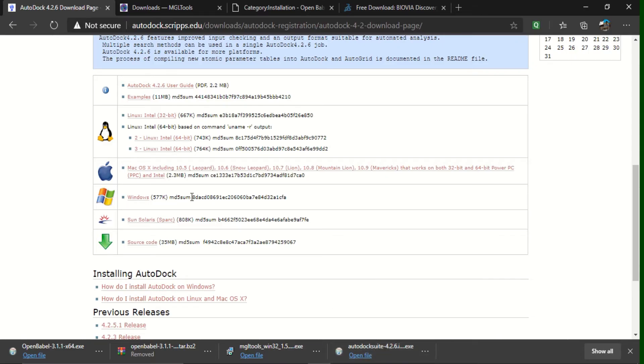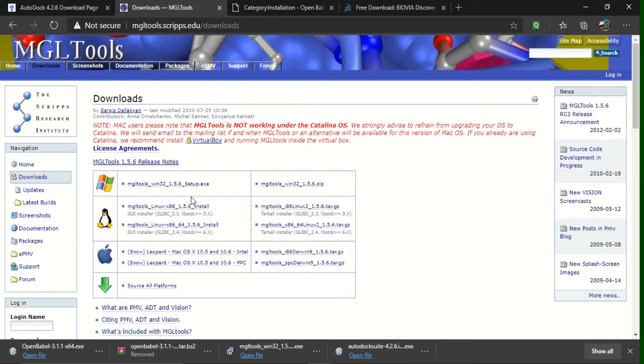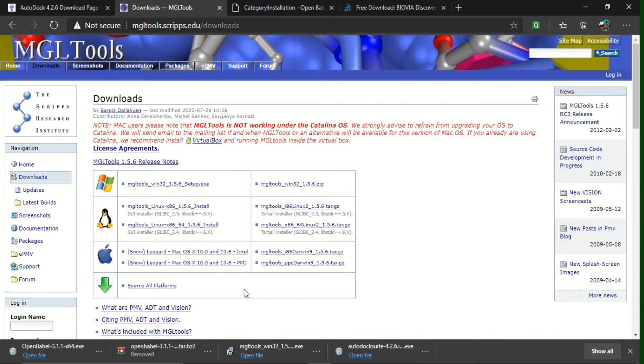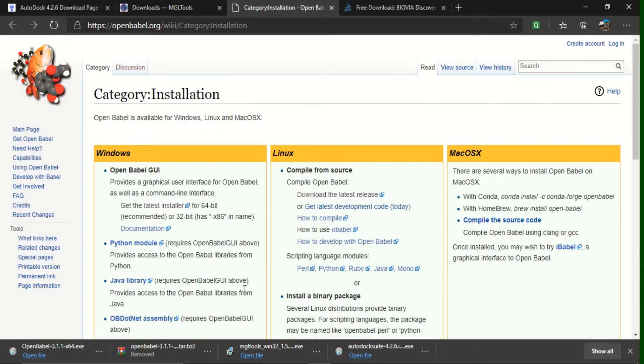And next, coming to MGL Tools. MGL Tools, also I have downloaded this Windows version, what you can see it here.